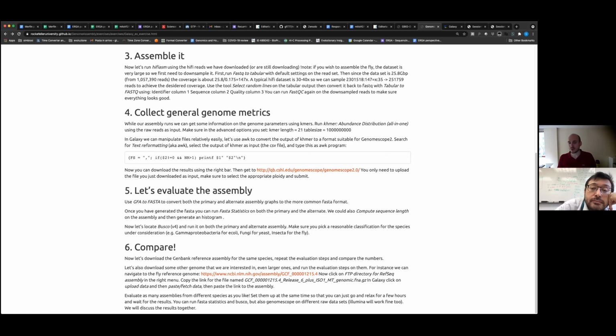So I think it's useful to understand what's going on here, and it becomes obvious when we use your results that you already have to compare the file before and after we apply the AWK transformation to it, okay? We can do that. As a general term, AWK is basically a binary file and a software that allows you to convert and manipulate any kind of file.